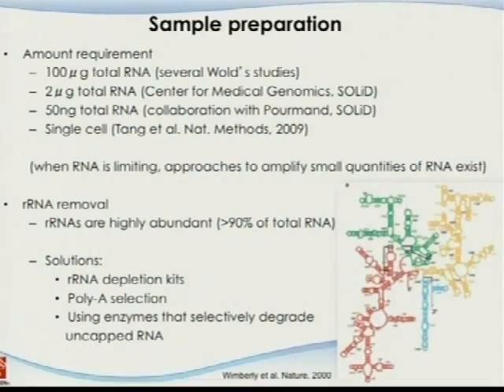Our experience is anywhere from 15% of reads being ribosome reads to 80%. So think of your experiment: you spend a lot of money, you sequence really deep, you have 50 million reads to cover the transcriptome, and it ends up only 1 million or 2 million are usable. The rest are ribosomes. It's a pretty bad thing to go through. These are things that you really need to be very careful about.